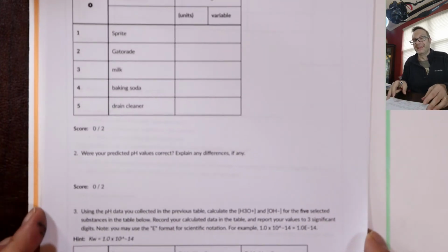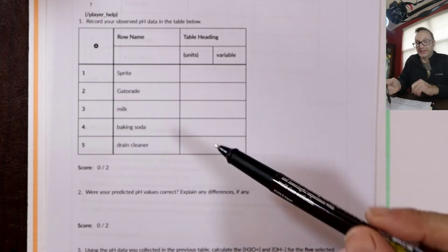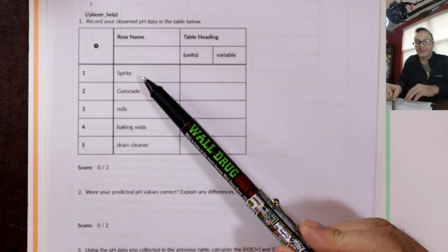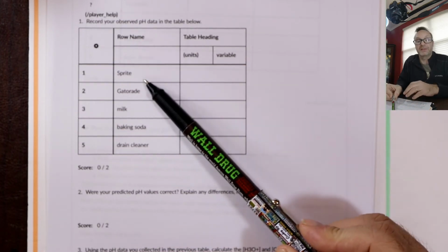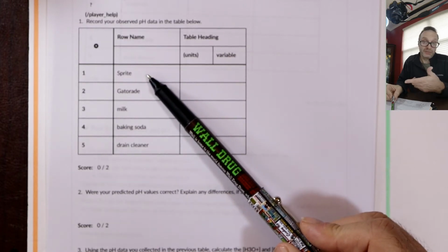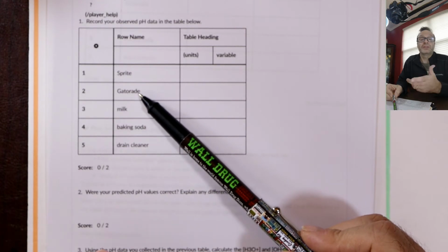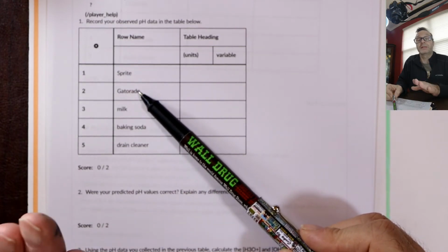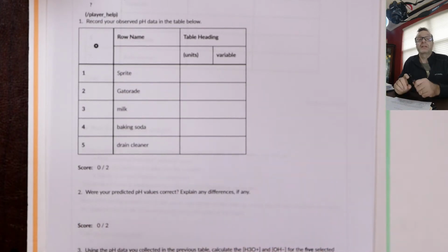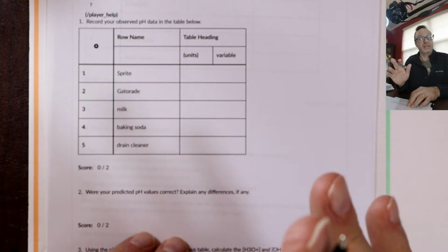Next thing, flashback to Chemistry 100. So, you're looking at the pH of various solutions. Simply Sprite, hint, hint, it's got carbonic acid, right? All carbonated drinks have carbonic acid, should be acidic. Gatorade, mostly sugar water, it's non-carbonated, so it should be close to neutral. Milk, any physiological material is close to neutral. Okay, blood, milk, similar, pH 7.2 maybe.